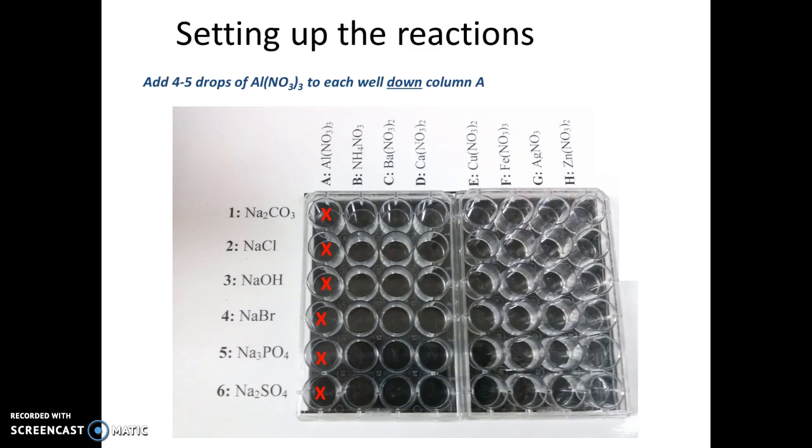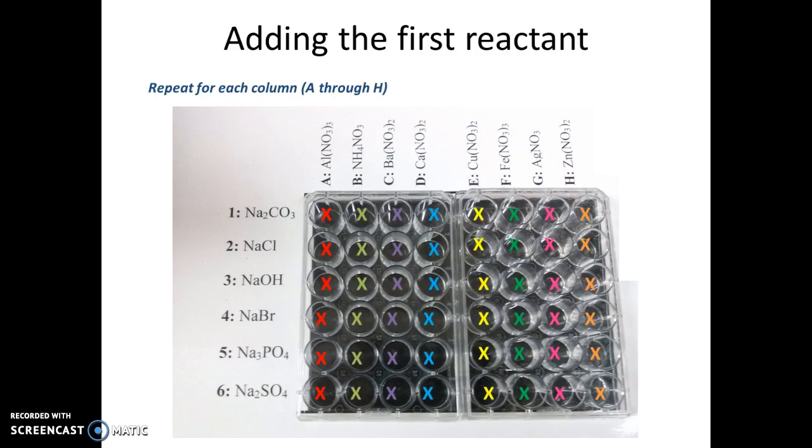I'm going to be adding aluminum nitrate to a total of six wells as I go down column A. I'm going to repeat this for columns A through H—locating the reagent listed at the top and adding it to a total of six wells as I go down each column.